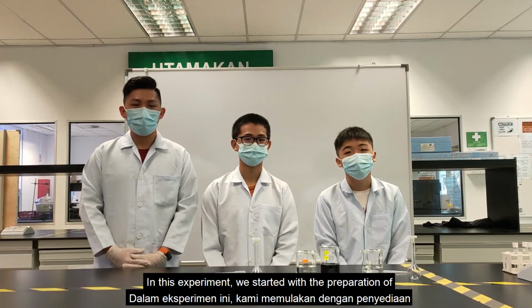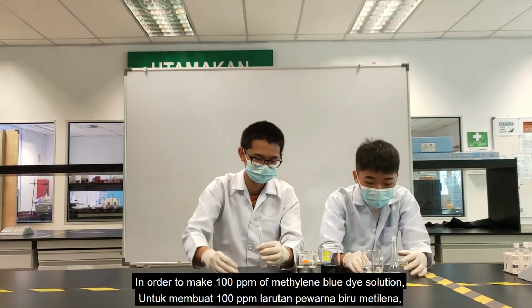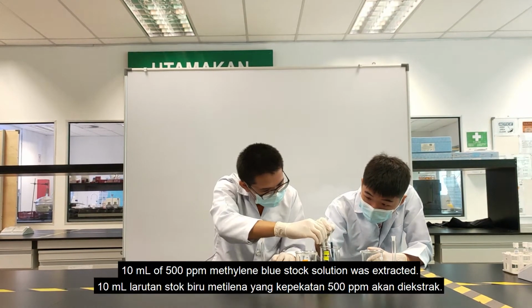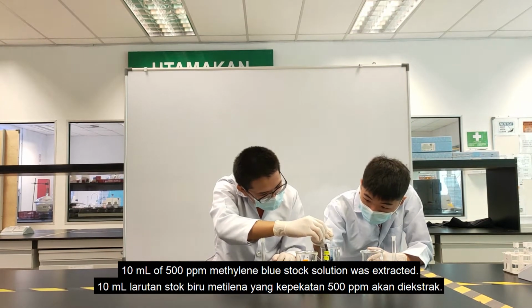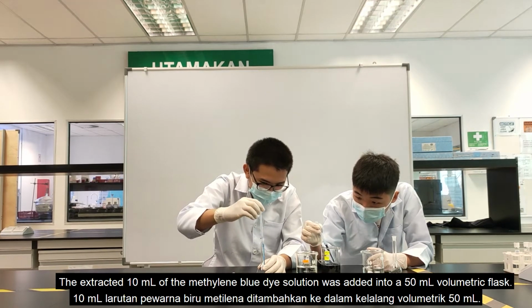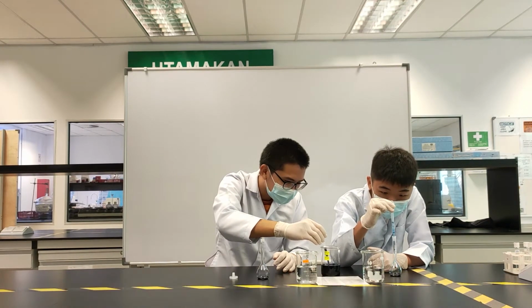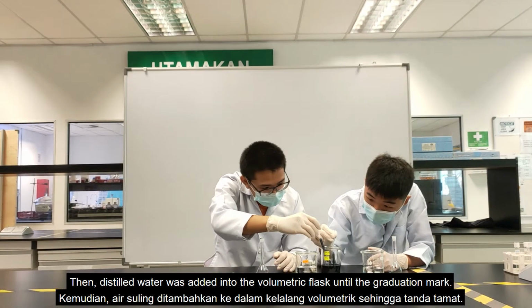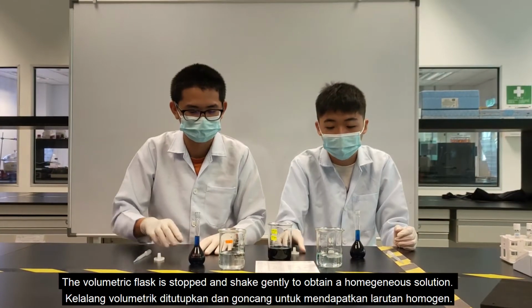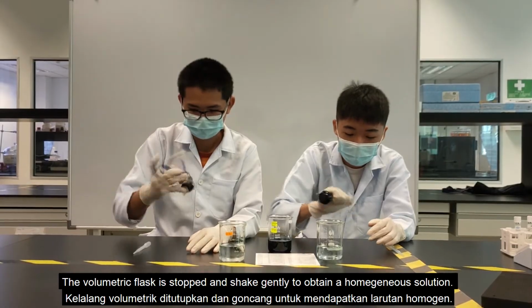In this experiment, we started with the preparation of the synthetic methylene blue dye solution. In order to make 100 ppm of the methylene blue dye solution, 10 ml of the 500 ppm methylene blue stock solution was extracted. The extracted 10 ml of the methylene blue dye solution was added into a 50 ml volumetric flask. Then, distilled water was added into the volumetric flask until the graduation mark. The volumetric flask is stoppered and shaken gently to obtain a homogeneous solution.